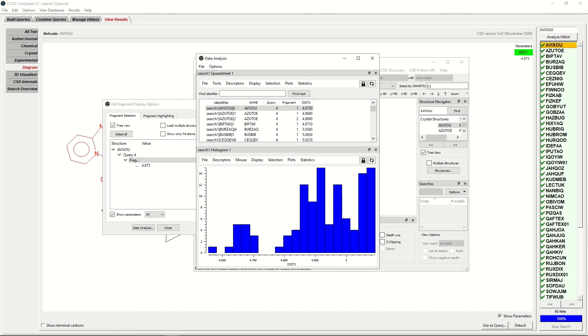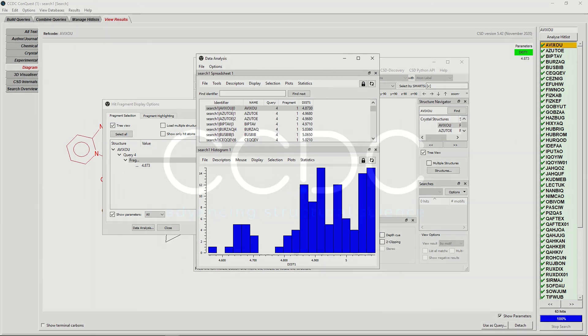You should now be able to use Conquest to search Complex Metal Organic Framework Fragments. Thank you very much for watching.